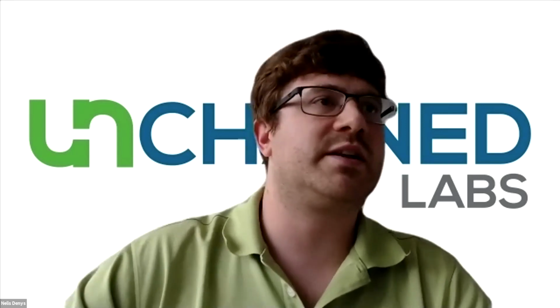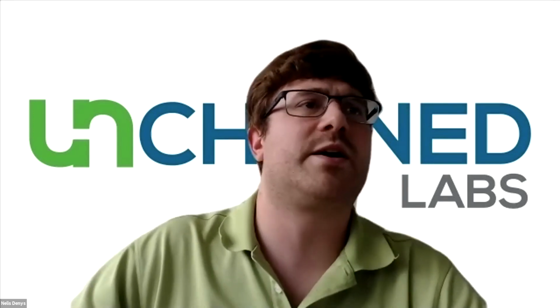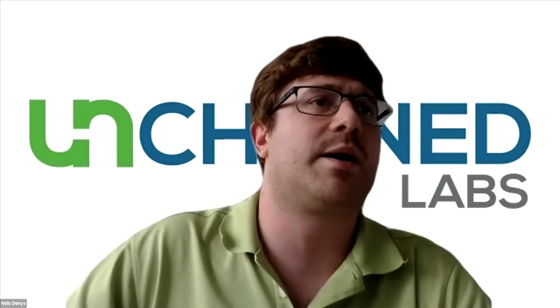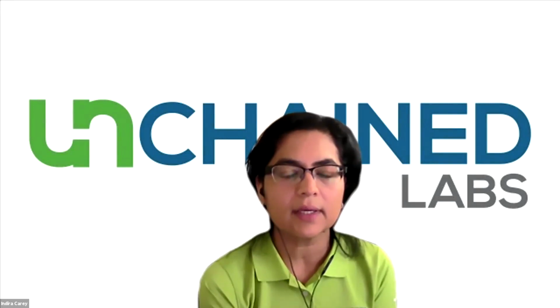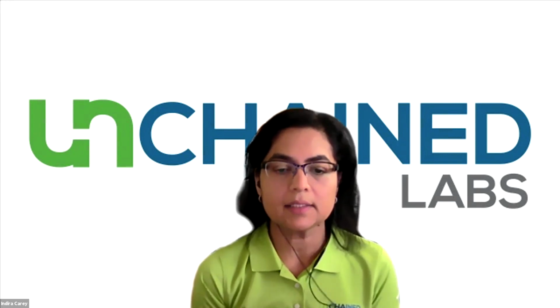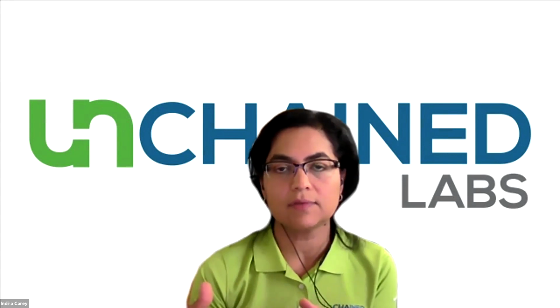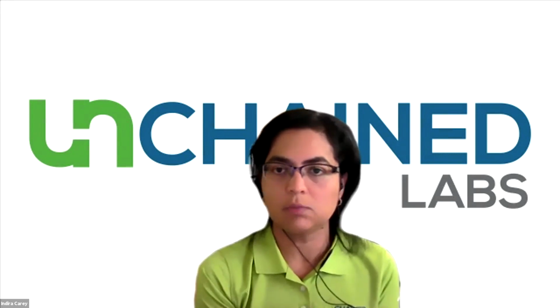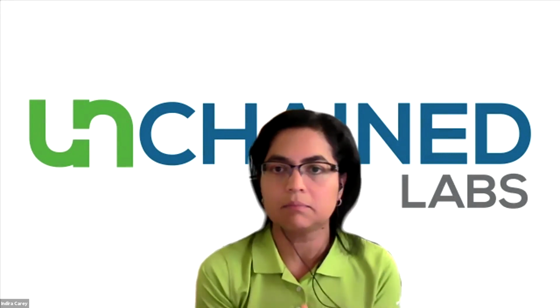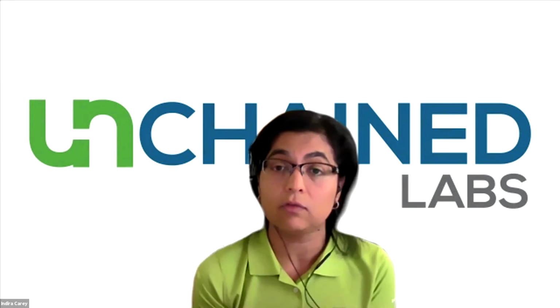Final question, and then I think our time will be done. Can you introduce how to use Lunatic in NGS labs where it's filled with Qubit? So I think a good starting place is to start with your known concentrations of samples that you've gotten on the Qubit, and just move over to the Lunatic and basically just start reading those samples that you've validated.